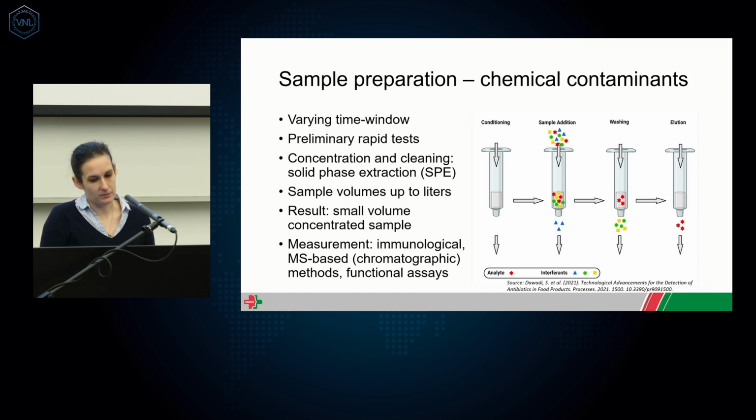And we have to think about this process and define the level of safety which is necessary for the sample preparation of a sample.